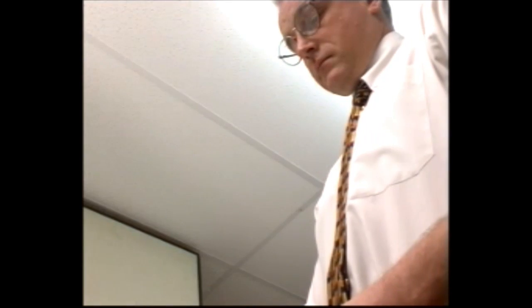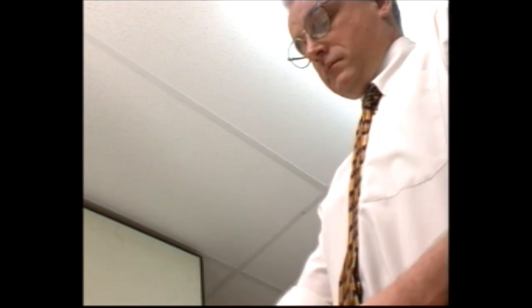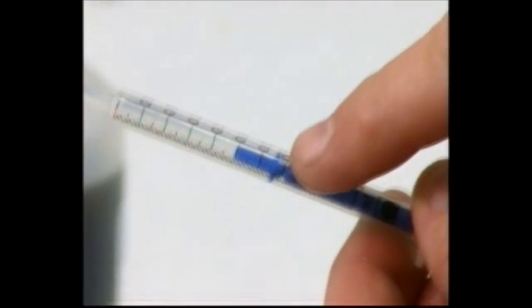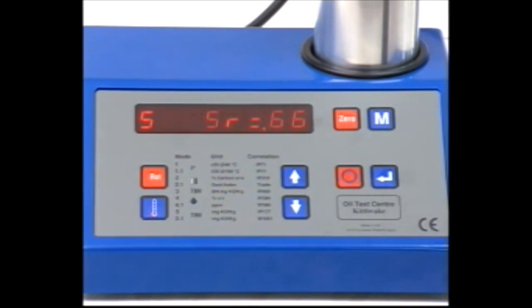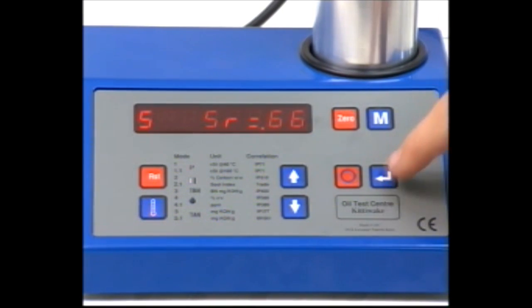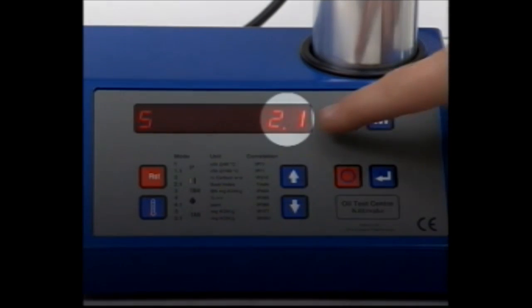Press return on the unit and use the speed and arrow keys to enter the syringe reading. Press return again to see the TAN displayed.